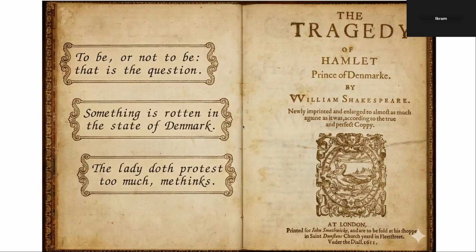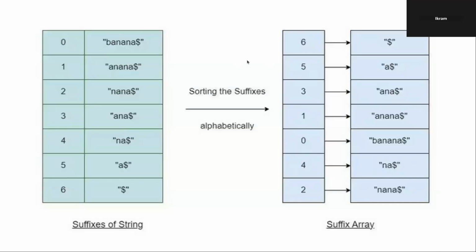If we talk about the STAR tool, STAR uses its own algorithm called a suffix array. The genome contains 3 billion bases. If we want to search for a read of 100 to 150 bases, it's hard to find that read among 3 billion bases. For that reason, we need to represent those 3 billion bases in a way that is efficient to search. In this way, the suffix array is very efficient and handy.